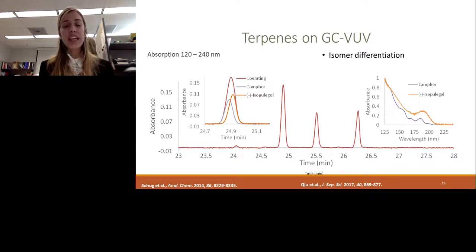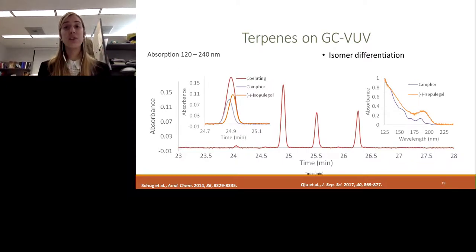Because they have identical properties, but they may have different medical benefits. They have different fragrances. They have different odors. So the two different enantiomers of alpha pinene may be extremely different in the properties among each other. And this is why it's important to actually differentiate and quantify both enantiomers and not only alpha pinene.